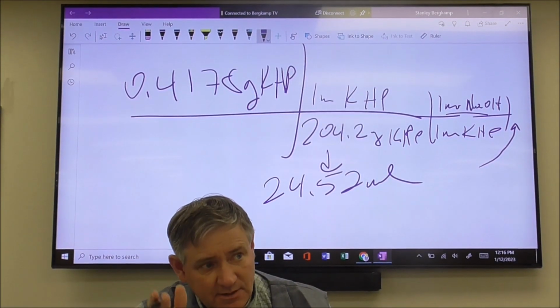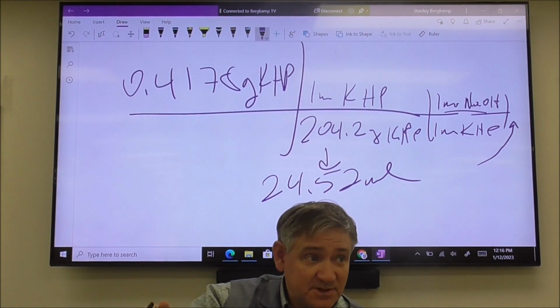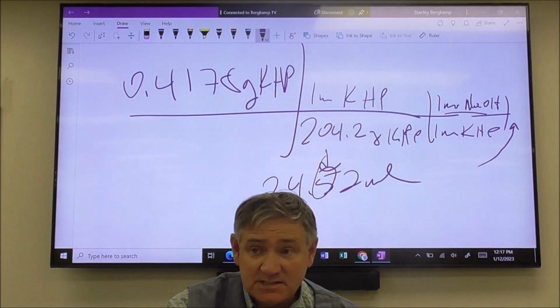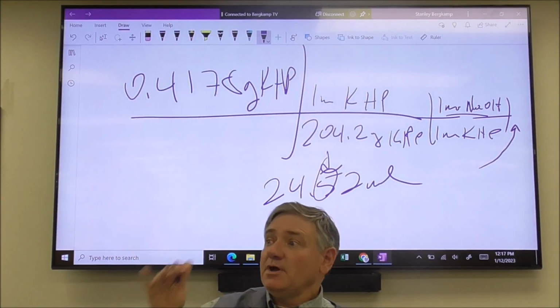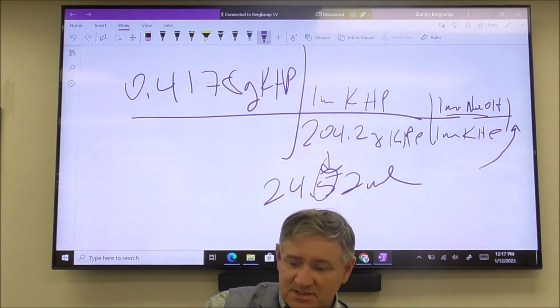On any reading that you do with these burettes, we paid a lot of money to get very precise burettes. Use them wisely, okay? You're always going to know the whole number and estimate the hundredths. And that estimate might be a 0. If it was exactly 24.5, write that as 24.50. So be consistent on how you measure these things.